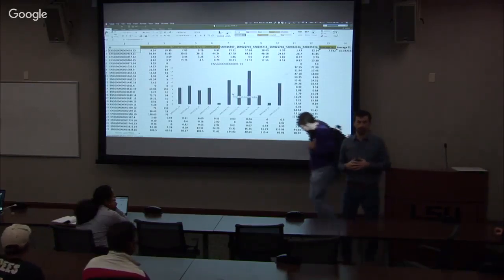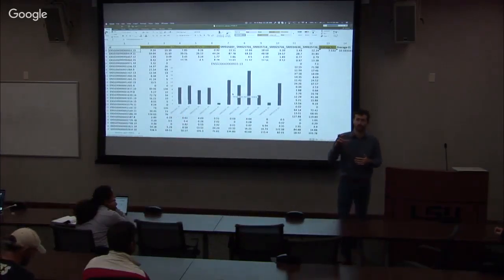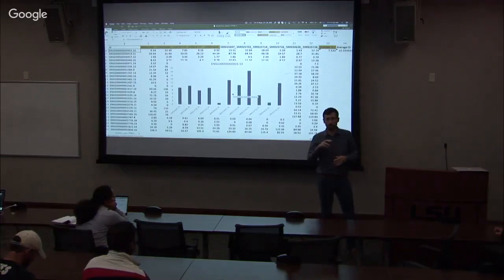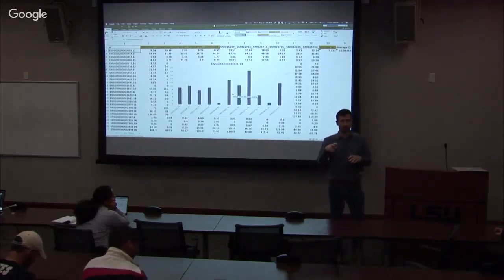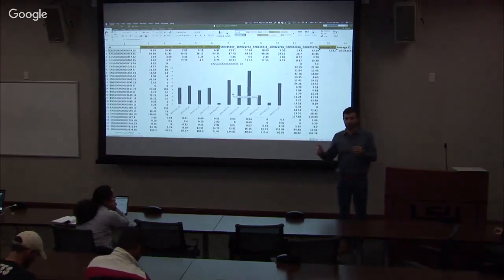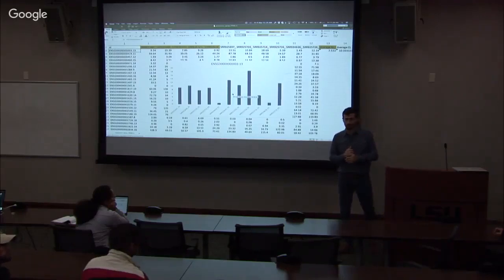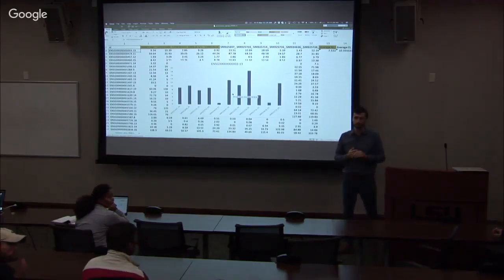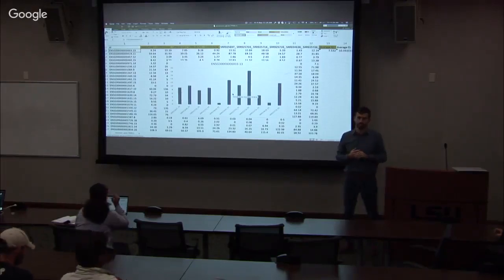You do the means, you line the means, and you actually normalize, adjust for its own noise, right? So there's a certain level of noise in each sample, and then you normalize it between them, and between samples you adjust the means. So are these in the online tutorials? Yes. Okay. Thanks.